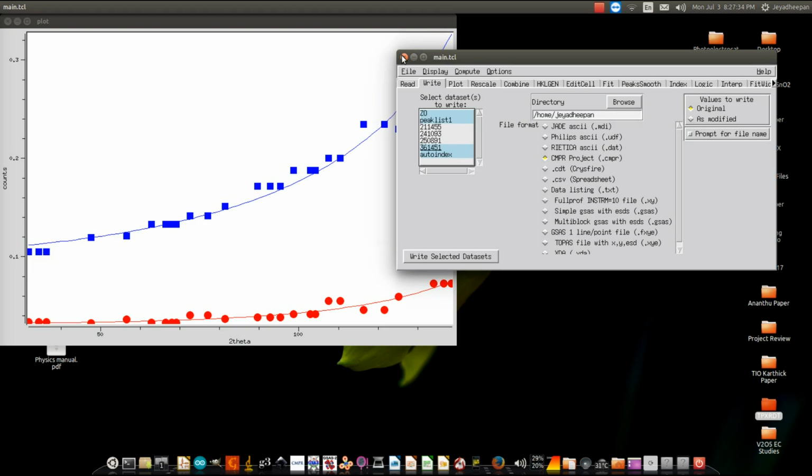Okay. So using these D and S relations, you can find the crystallite size and strain. For this particular Lx value of 10, you get a crystallite size of roughly 70 to 80 nanometers for this sample, and for this Ly value of 1.2, the strain will be roughly 0.02. If you substitute this value here, you will get the strain value as 0.02%. So likewise, you can calculate the crystallite size and strain.